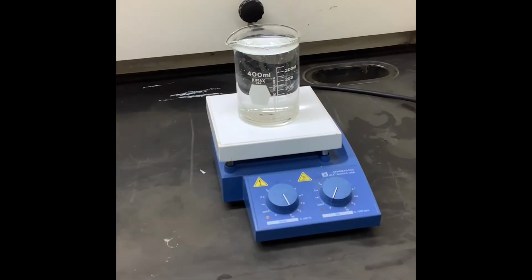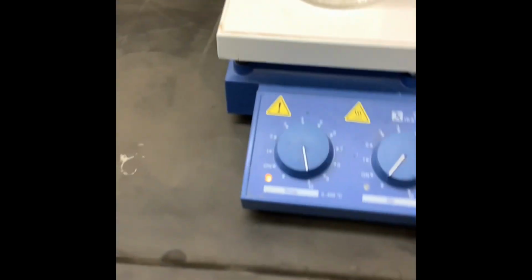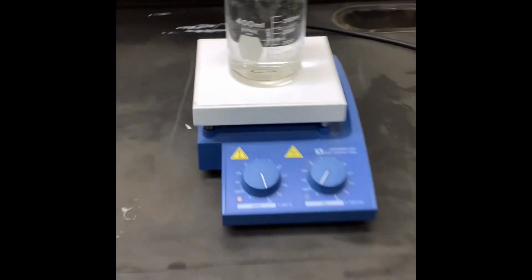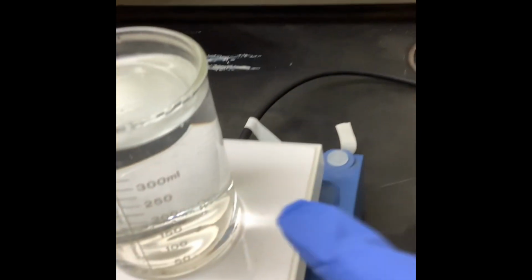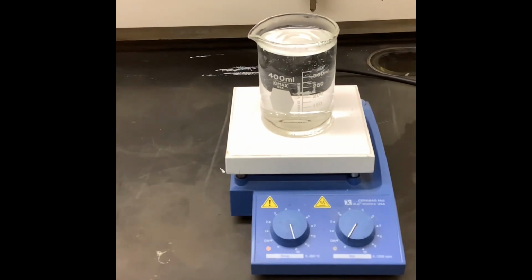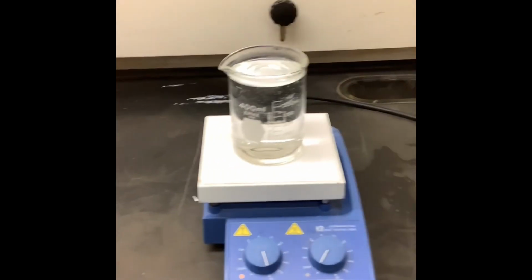The first thing you're going to want to do is start your water bath. I always set it at the highest setting. This heat block is kind of old and doesn't work well, so you have to fidget with it to make sure that it's on. You want to see this orange light on. I usually have tape going on in the back to make sure that that's happening. But you want this water to be boiling or at 100 degrees Celsius. I always just wait until it boils. I don't use a thermometer, but we do have those if you want to be sure.